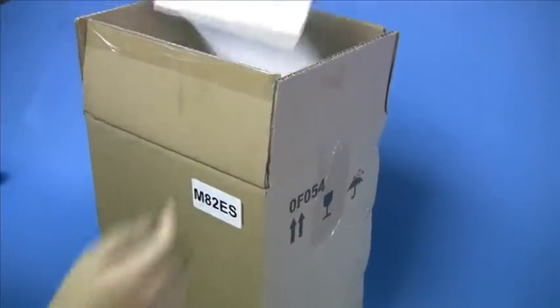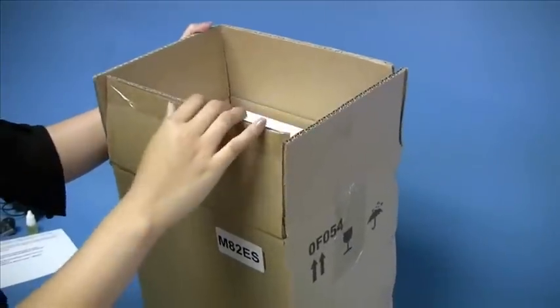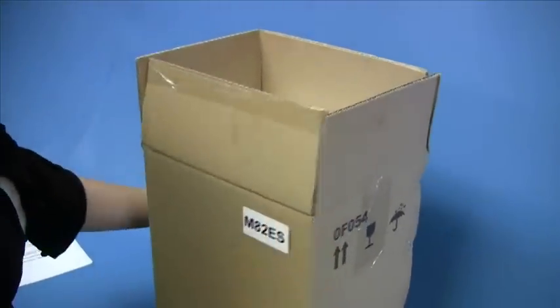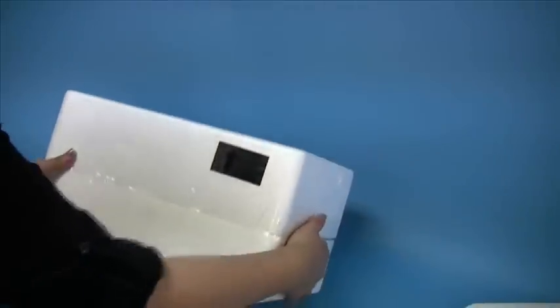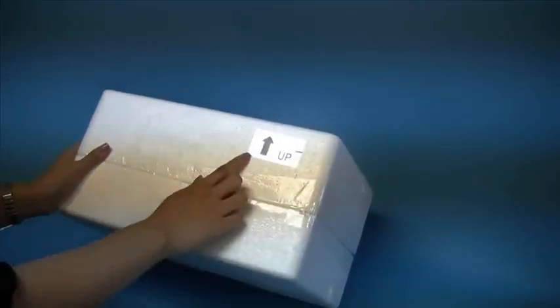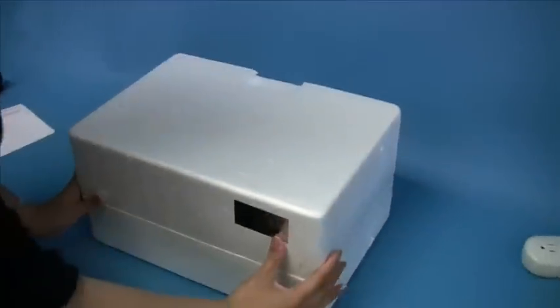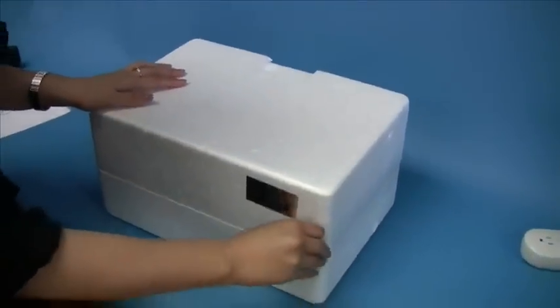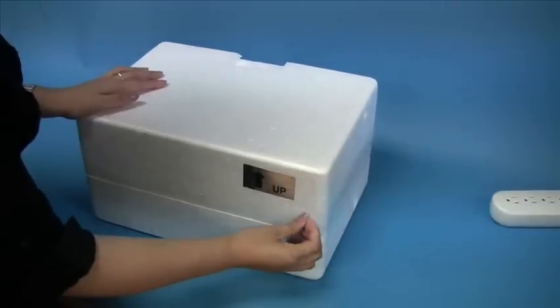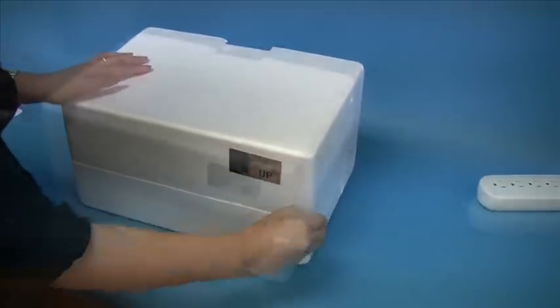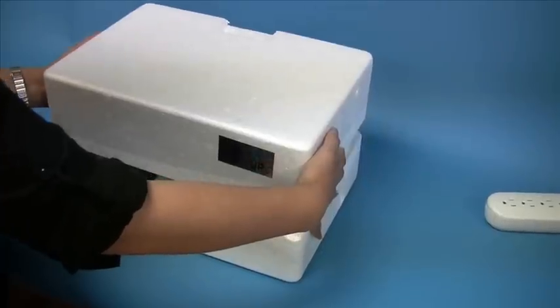Inside, you should have a cushion letter that has a link to the instruction manual. Make sure to keep it and not discard it. Now take out the styrofoam container in the box. Make sure to find the up sign with the arrow pointing upward on the styrofoam container and open it. Move the cover very gently and carefully.